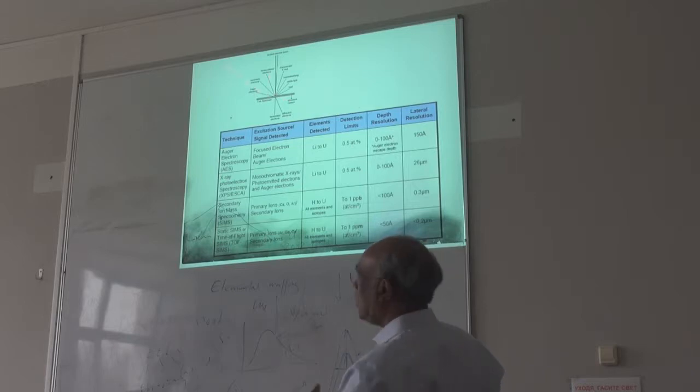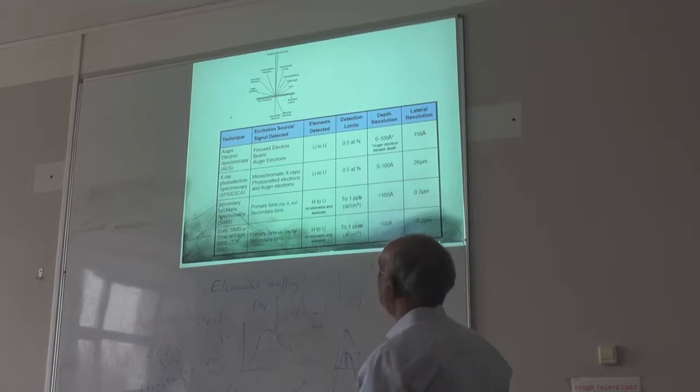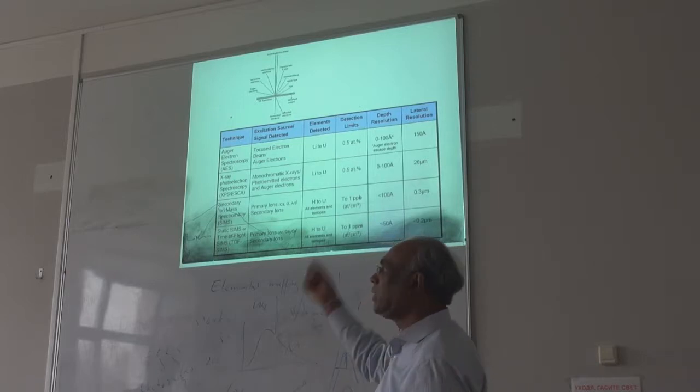Then you have backscattered electrons, then transmitted, the zero loss electrons, then elastically or inelastically scattered. Also you can produce heat, that's phonons. Then you have Auger electrons, I don't know if people are familiar with Auger. It's a secondary electron.